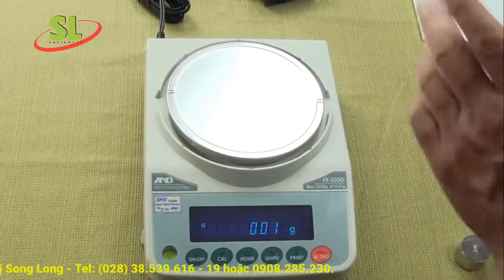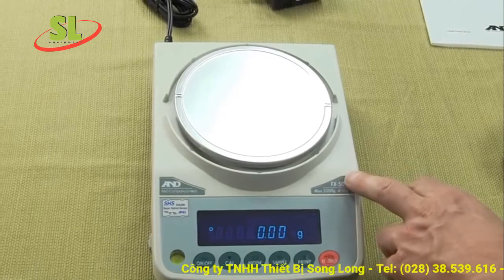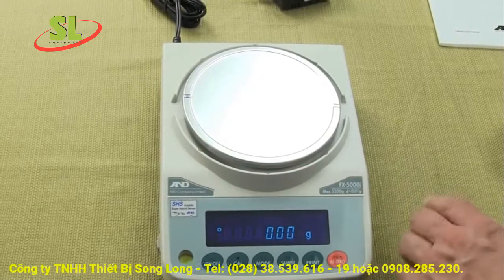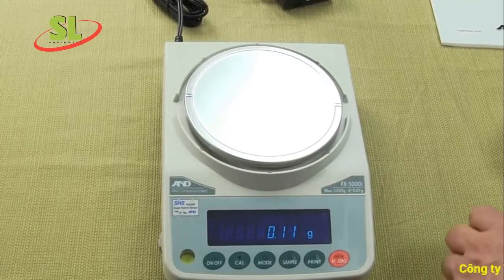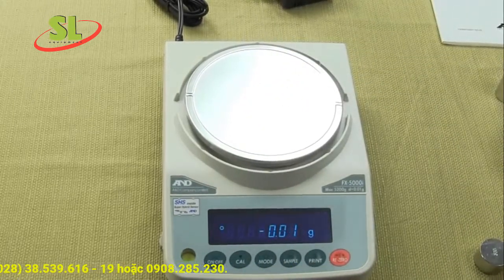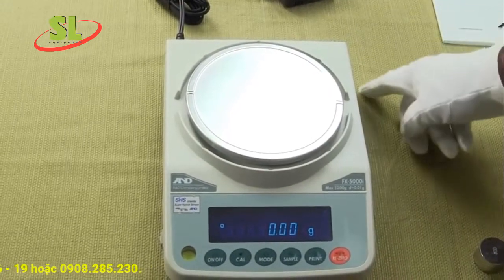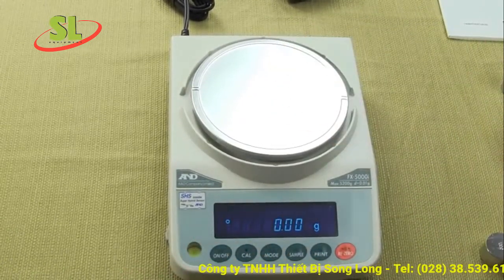The balance comes with an AC adapter and a five-year limited manufacturer's warranty. The FXZ series has motorized internal calibration. There's a spirit bubble level indicator in the lower left-hand corner and adjustable feet — it's critical to always have your balance level. The balance features A&D's proprietary Super Hybrid Sensor, which makes it extremely fast. No other manufacturer has this SHS technology. The footprint is a compact 7.6 by 10.3 inches, 3.3 inches high — a small footprint with a big pan.